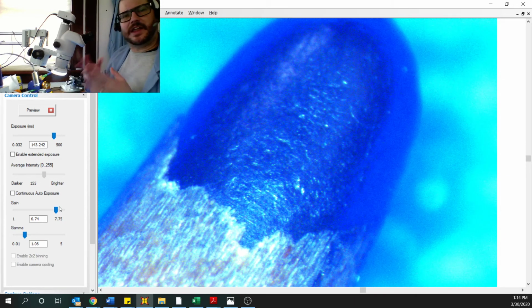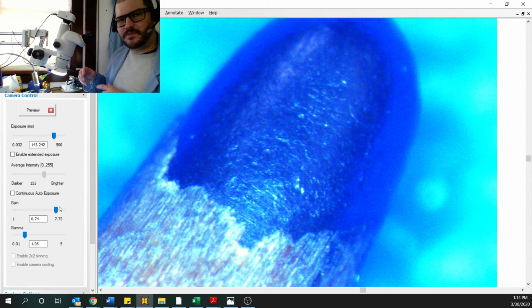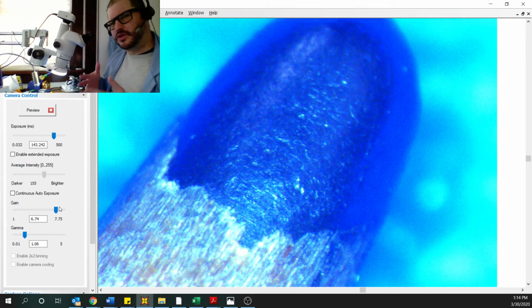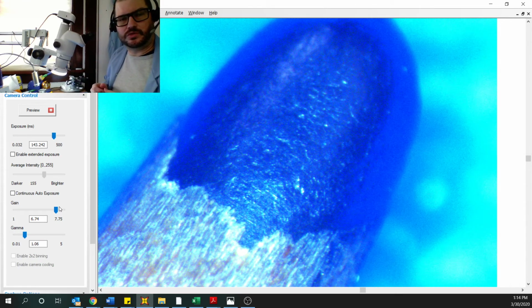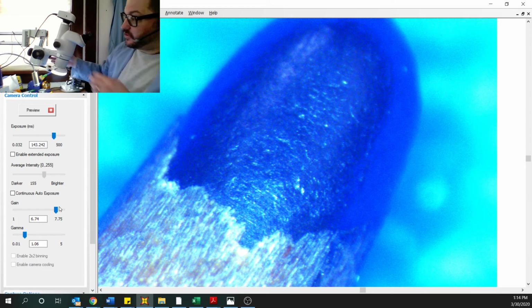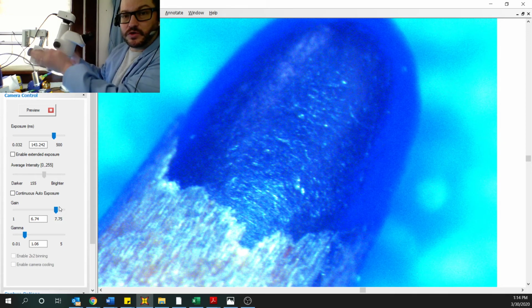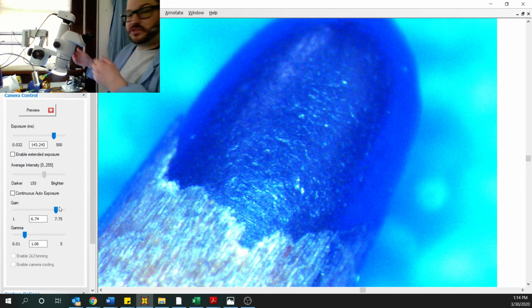The microscopes have a light source. Some of them are on the top, which would be for things that are typically not microscope slides, although you can put microscope slides, but most likely you need a bottom light source to put under the microscope slide to look at it. And there is a focus knob, which is used to focus into and out of the thing we're trying to look at, and a boom stand for this one.